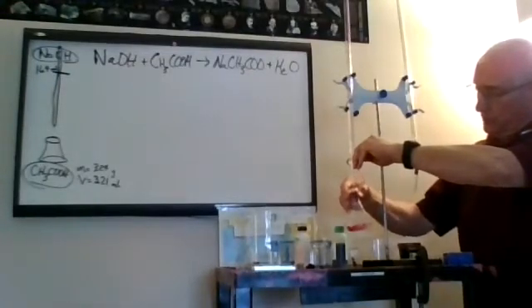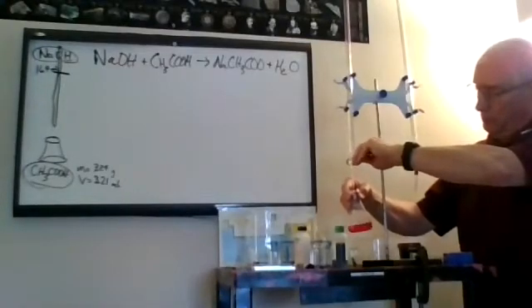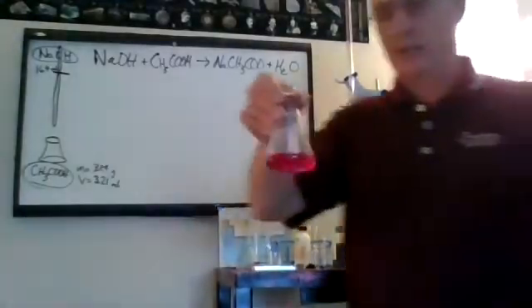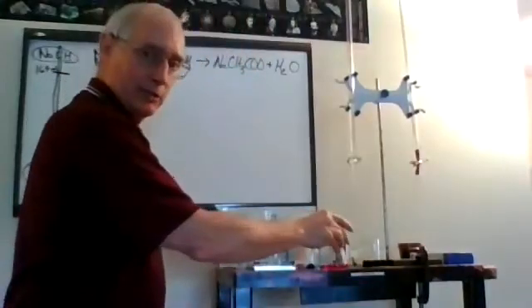Now I'm down to where I'm splashing it in drop by drop. Whoop, still swirls out. Still swirls out. Ooh, we're really close now. Whoop. See how it only takes one drop to get there? And again, I overshot with the base. I'll put that up there so you can enjoy it.